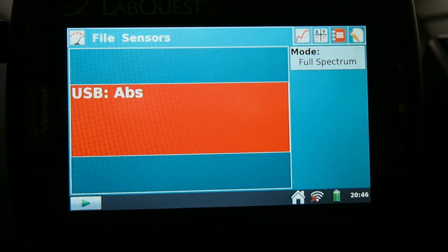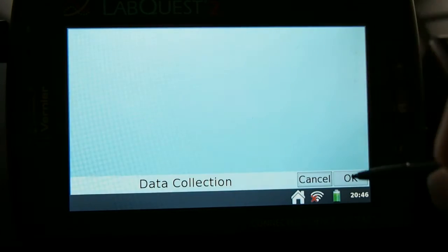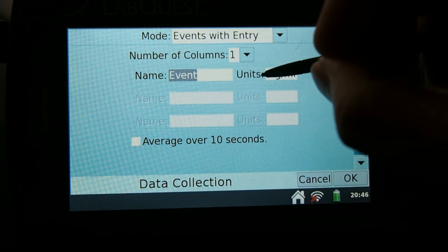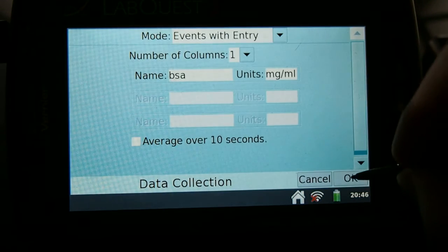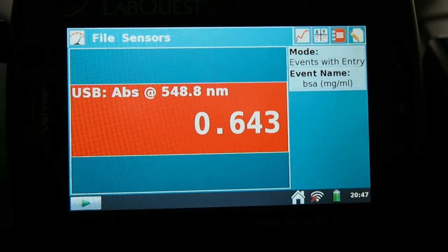After this, we can press on the meter button and change our mode from full spectrum into events. We can label it milligrams per milliliter, and we can also change this later on. So we'll just leave it at events or change it to BSA — it does not matter at this point. Once again, we can discard the previous data using the stylus.